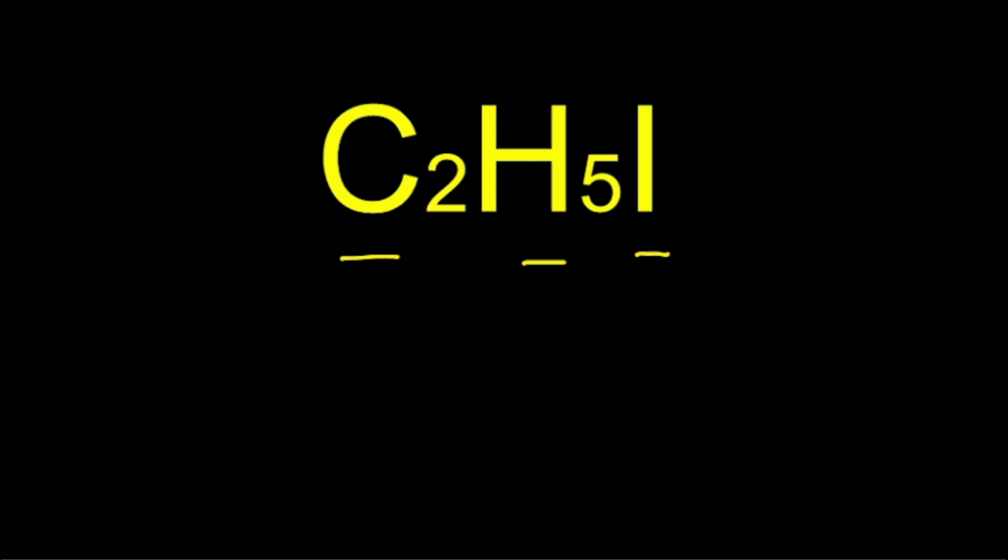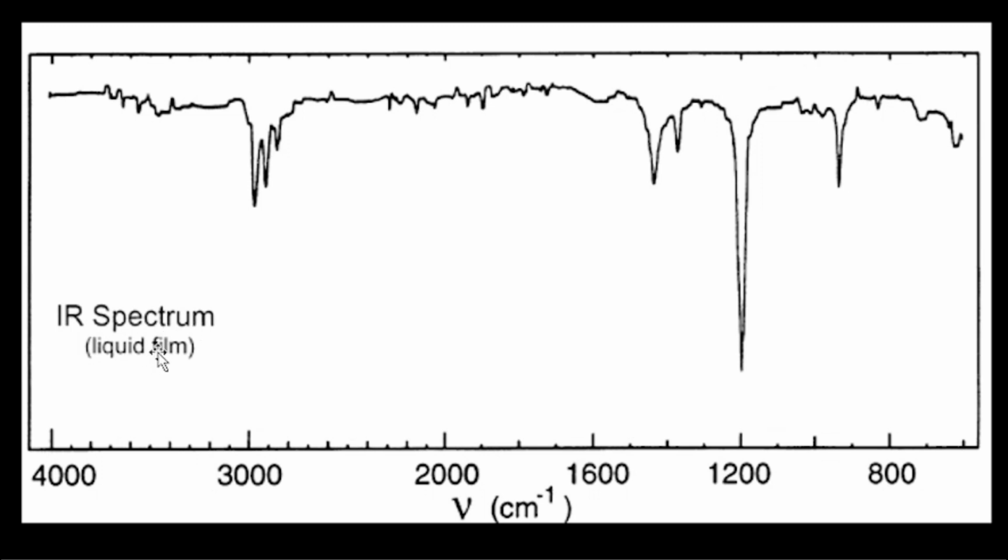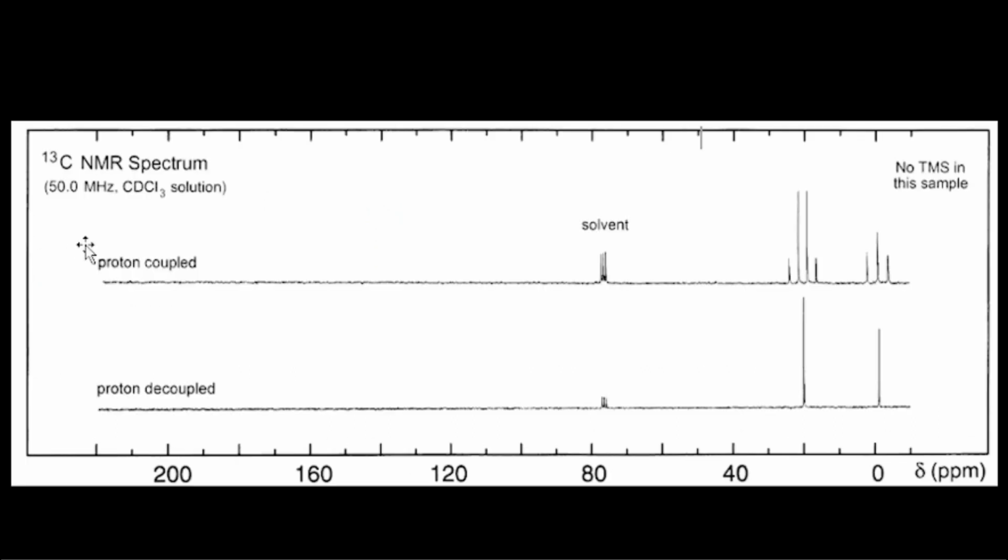Okay, so first of all, in the IR spectrum, you will see that no peak is present. No peak is given in the spectrum that we can circle and conclude that this functional group or that functional group is present. So it means that no functional group is present in our IR spectrum. So we will go to our C13 NMR spectrum.